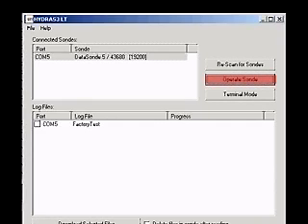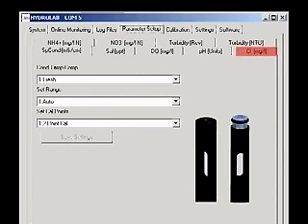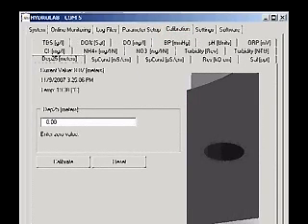Establish a connection to the sonde with Hydrus 3LT. Click the button labeled Operate Sonde. When the sonde finishes its initialization, check the Parameter Setup tab, then click the Chloride Milligrams Per Liter tab. Type the number of calibration points you are using in the box and click Save Settings. If you change the number of calibration points, you will need to close the Hydrus window and reconnect to the sonde for the change to appear on the calibration screen. Click on the Calibration tab, then click the Chloride Milligrams Per Liter tab.